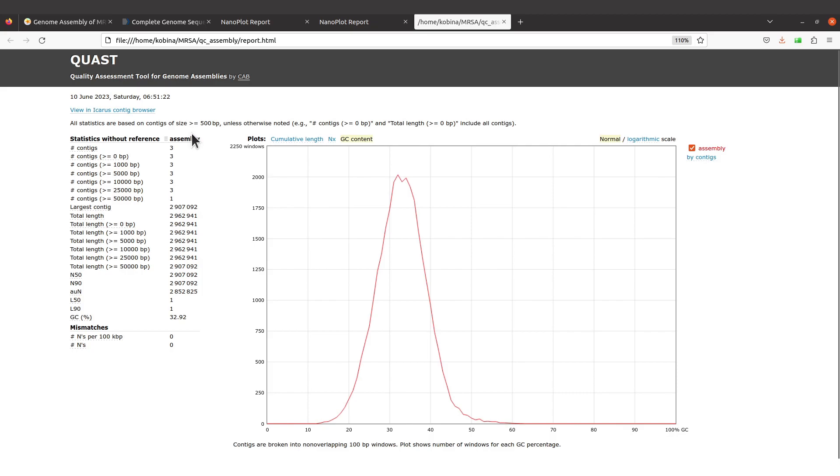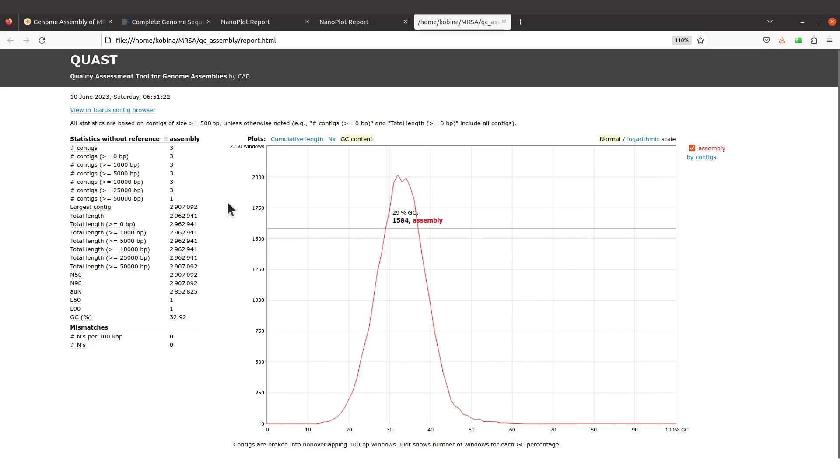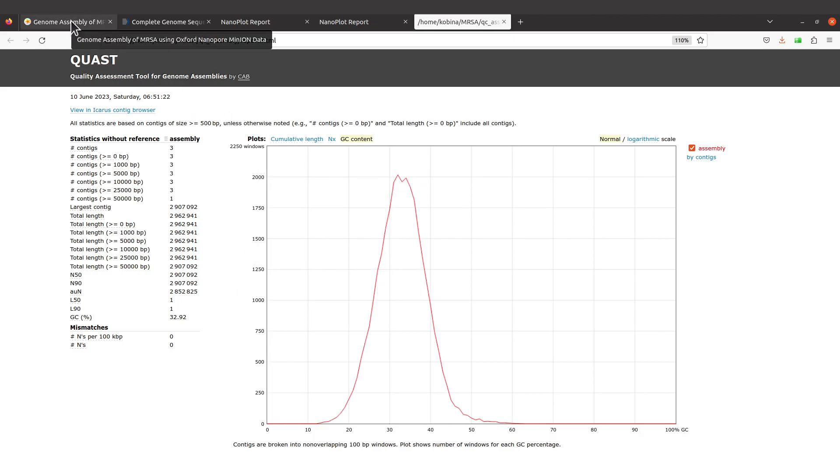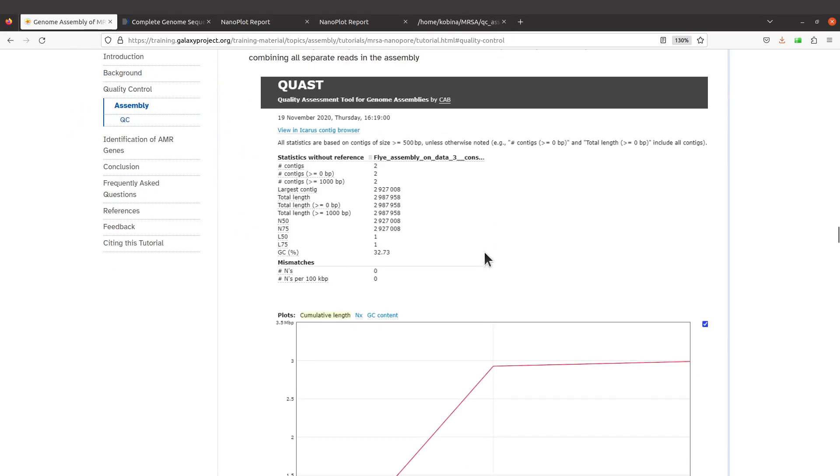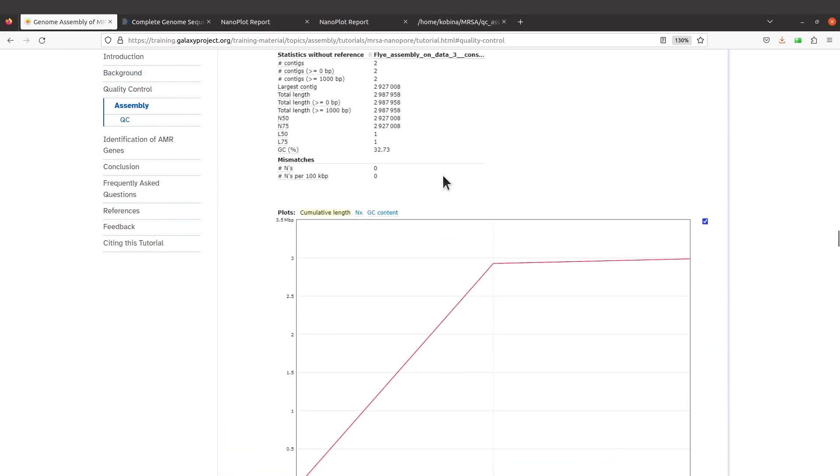If you supply QUAST with more than one file, then each of the files will have a separate column and their respective values will be placed under them. Let's take a look at the discussion that was done on the QUAST tutorial page and then compare with what we have. This is the report that they got.